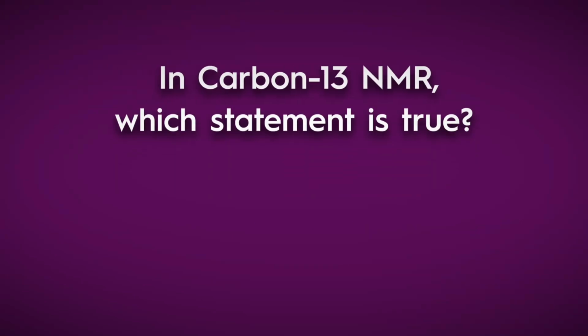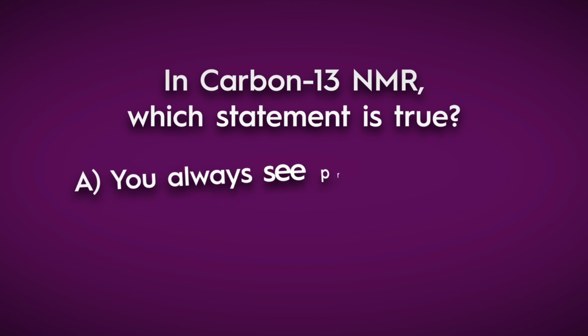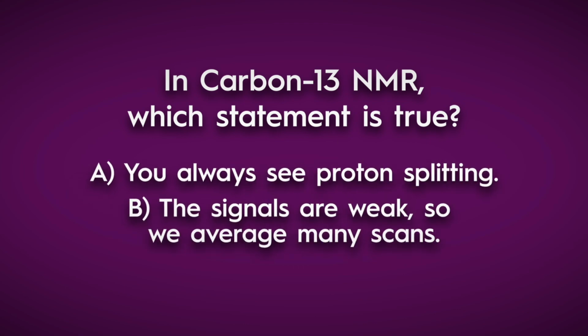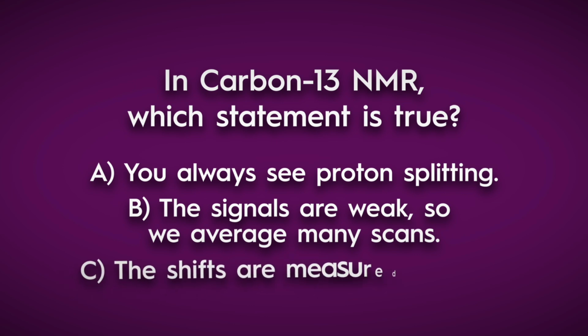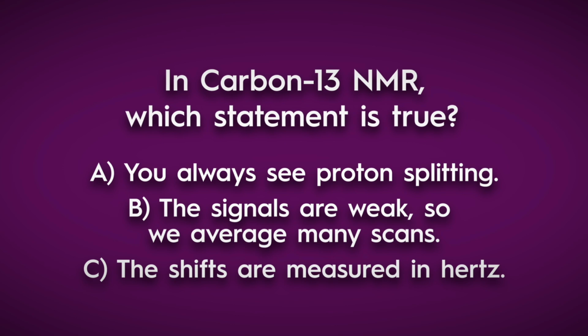Pop quiz. In carbon-13 NMR, which statement is true? A, you always see proton splitting. B, the signals are weak, so we average many scans. Or C, the shifts are measured in hertz. Hold your answer. We will reveal it in a moment.